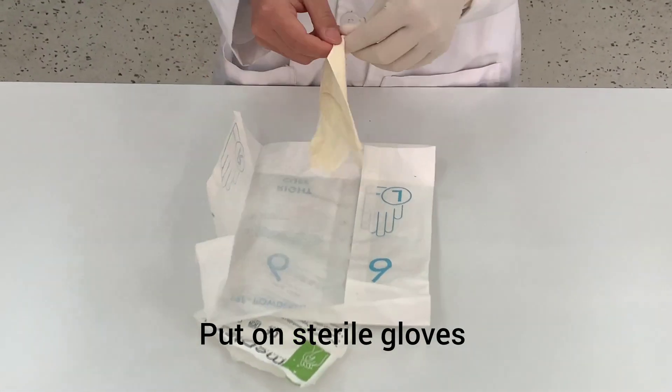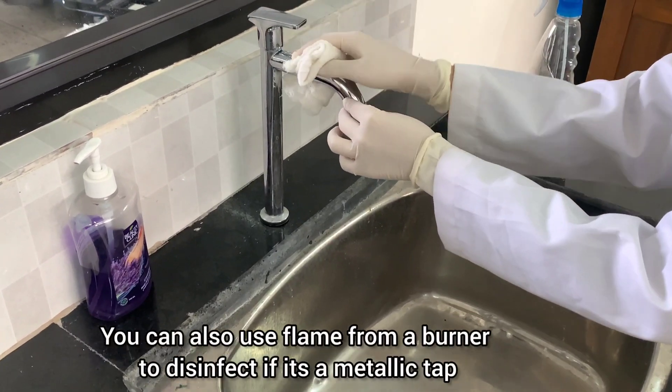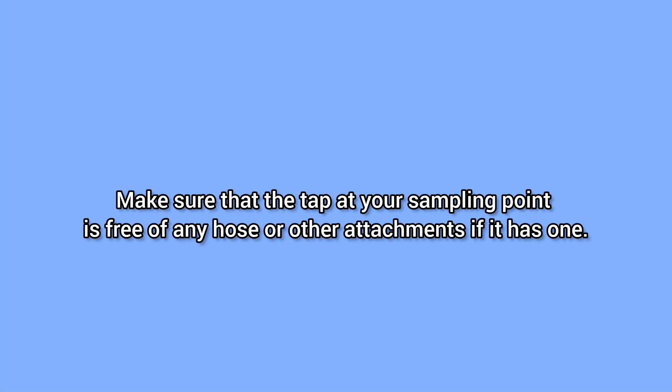Put on sterile gloves. Spray the alcohol on the tap and clean it with the help of gauze. You can also use flame from a burner to disinfect if it's a metallic tap. Make sure that the tap at your sampling point is free of any hose or other attachments if it has one.